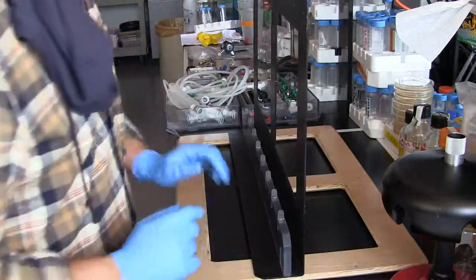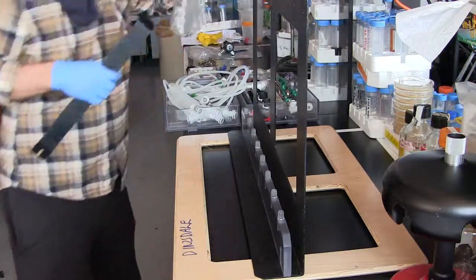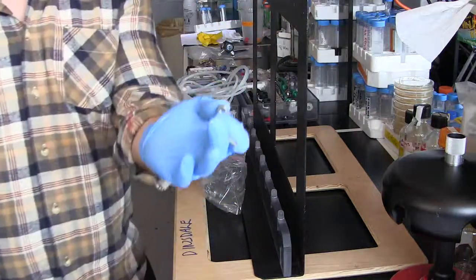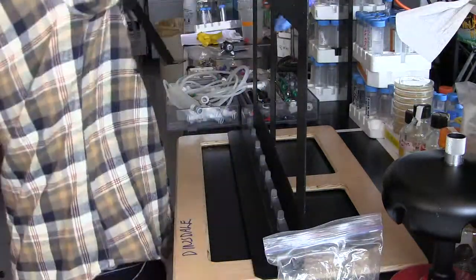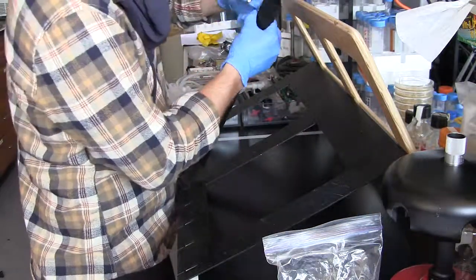Okay. Then when you stand it up, you'll see this kit is actually very light, it's very stable, but what we do as well is we grab another one of the bolts. A bolt and a nut and this back piece, and what we do is we place it like so. This piece here goes at the back.